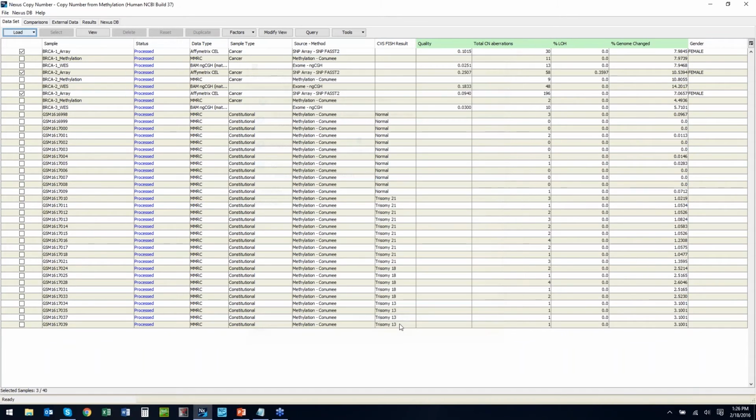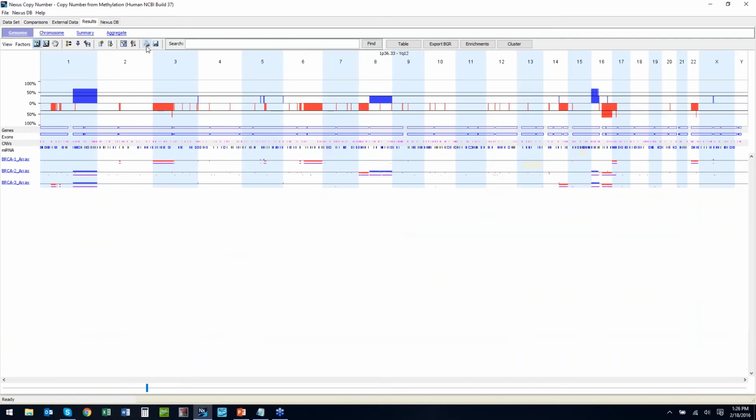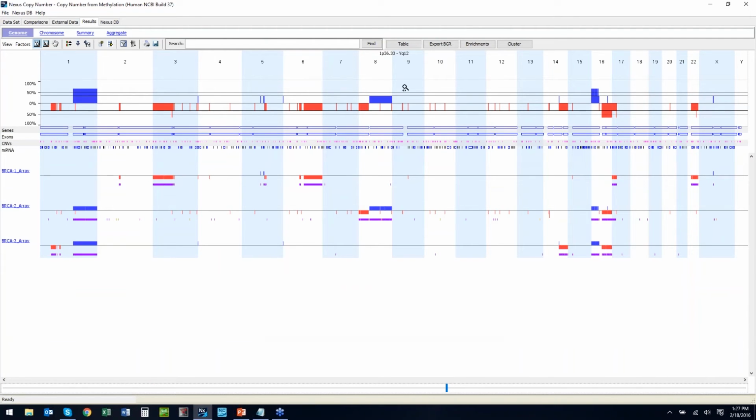And we can see here our copy number changes. So we have red for loss, blue for gain. The top is showing us our aggregate or summary profile, and then we have individual profiles for each of our 3 samples. I'm going to go ahead and add a factor that's showing our data source, so we're able to keep track as we're going along. All of these yellow ones are going to be indicating that we used a SNP array.